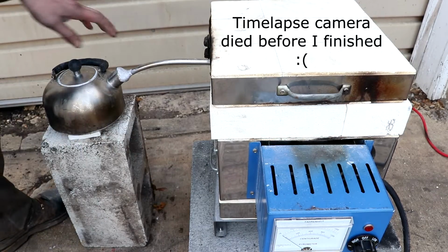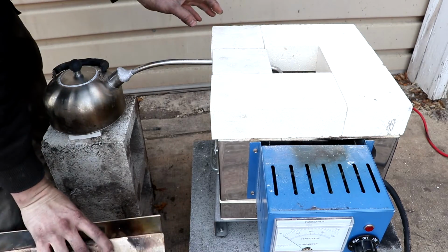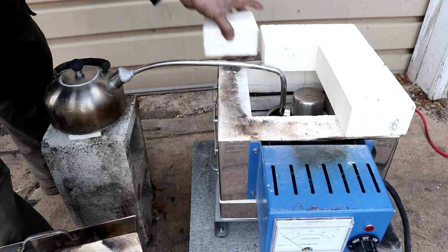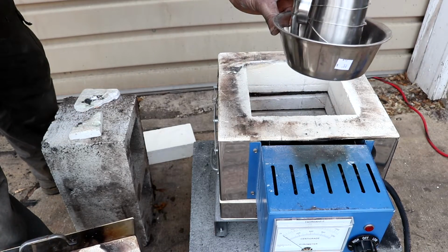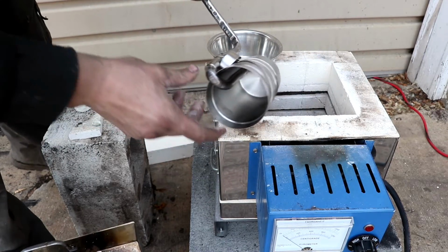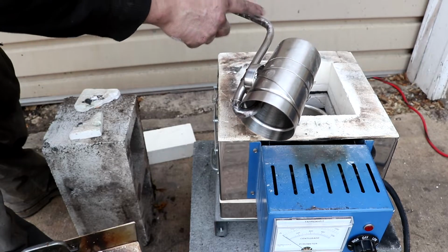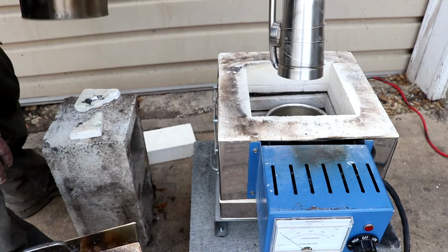Okay, so this is what I've come up with. You can see the kettle here. And if I pull the furnace apart, you can see how I did that. I had some spare fire brick, which I just cut to fit everything. And here is the reaction vessel itself. There's another stainless steel dish that goes here. I don't know if you can see down in there, but the tube just bends up and goes into the top of this. To bend this tubing as sharp as I did, I ended up filling it with tin, and that keeps it from collapsing. It wasn't easy to bend, but I was able to do it.